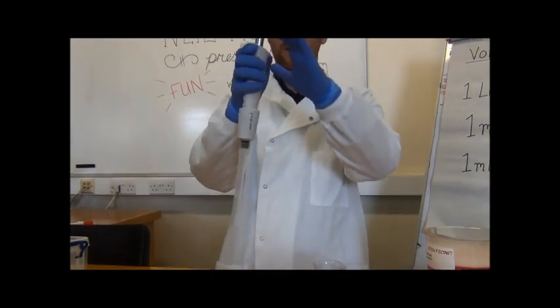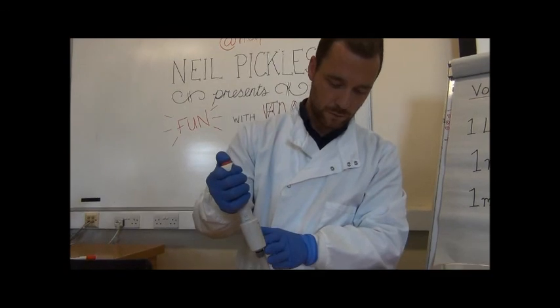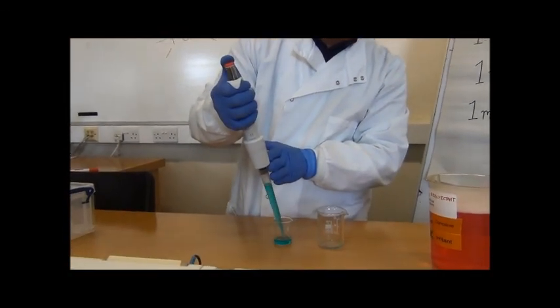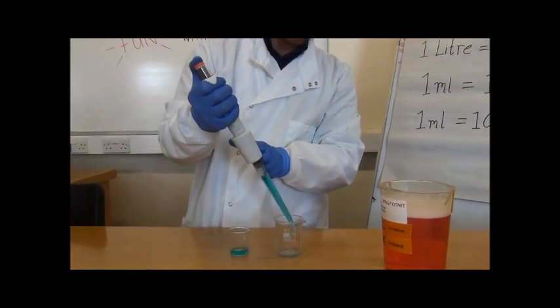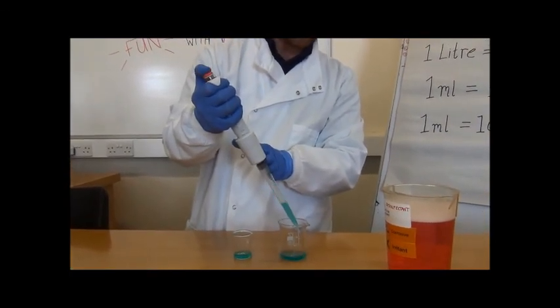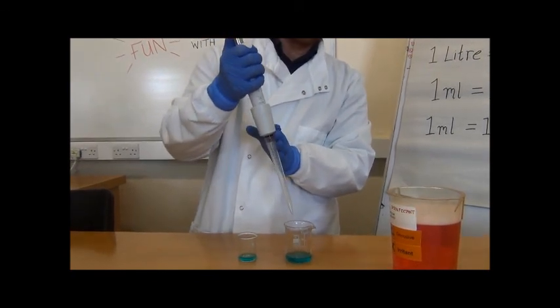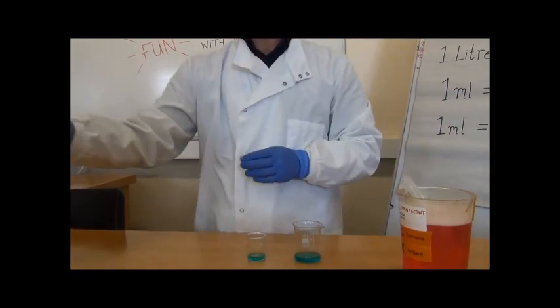Same principles apply: down to the first stopping point, slowly bring up the solution. Transfer, all the way down to the second stopping point, so all of the liquid has left the pipette tip, and then discard into waste.